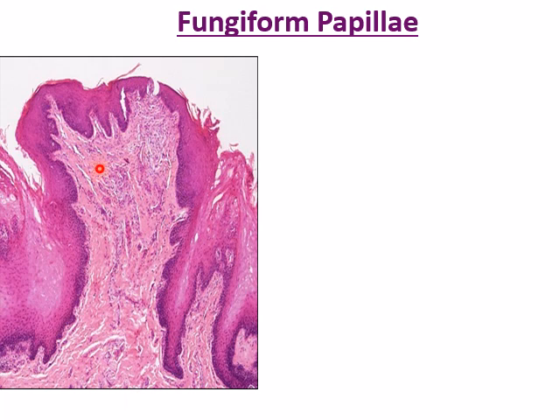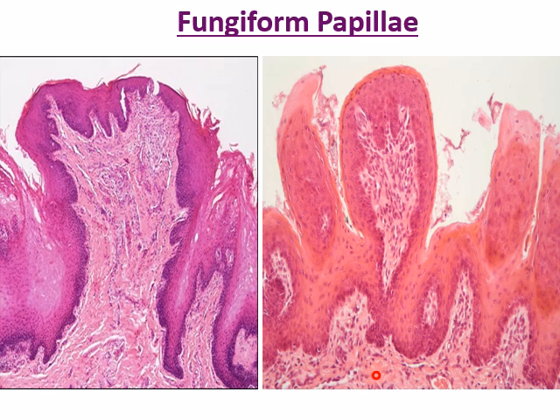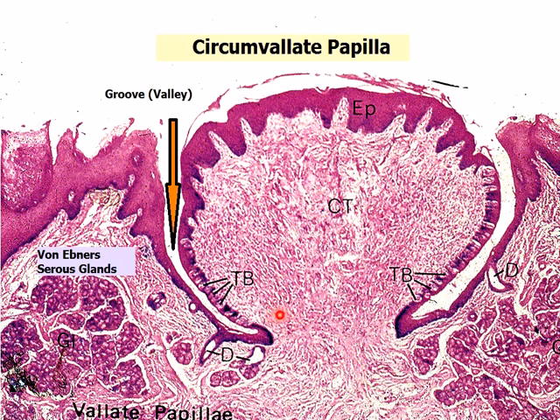Here is another type of papillae known as fungiform papillae. The third type of papillae is known as circumvallate papillae. You can see here that it's not raised above the surface, it is surrounded with a valley, and it contains many taste buds. They are present at the sulcus terminalis between the anterior two-thirds and the posterior one-third of the tongue. Circumvallate papillae. And here are the ducts.